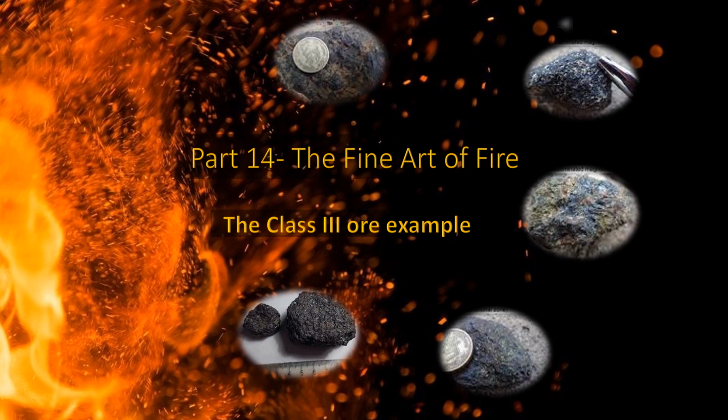In this presentation, I will be following the steps given in the charge table, taking you through the calculations in regards to Class 3 ore material in order to create the summary table of flux ingredients and quantities used to create the ideal slag and the required lead button. The calculations will be the same for Class 1 ore or concentrates.